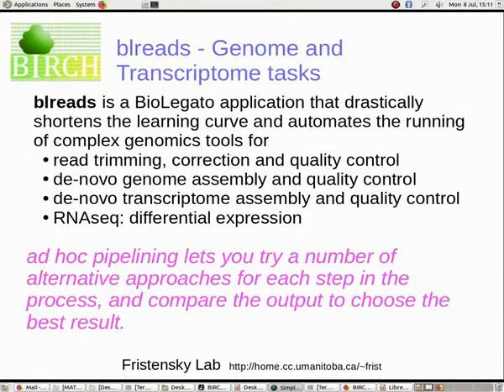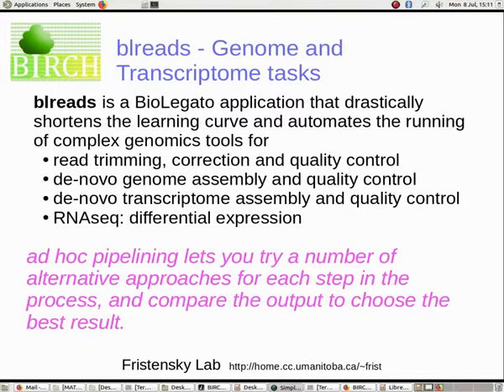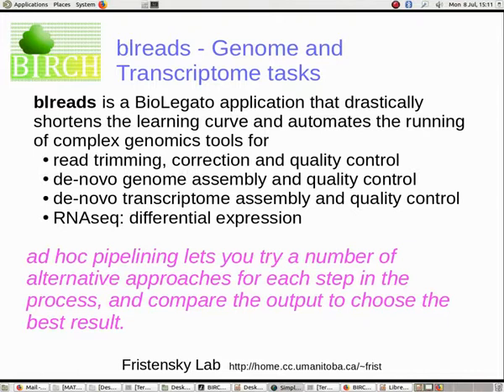Anyone who's ever assembled a genome or transcriptome or done differential gene expression with RNA-seq reads knows that the pipeline includes many different programs for read trimming, error correction, quality control, assembly, and read mapping. Every one of these steps requires that you install a program and that's usually very complex. Even more complex is the learning curve for every single program you have to use. BL Reads is a BioLegato application that seamlessly integrates all of these tasks and runs the programs for you, letting you evaluate your results at each step and then experiment with different programs and parameters to achieve the best result.